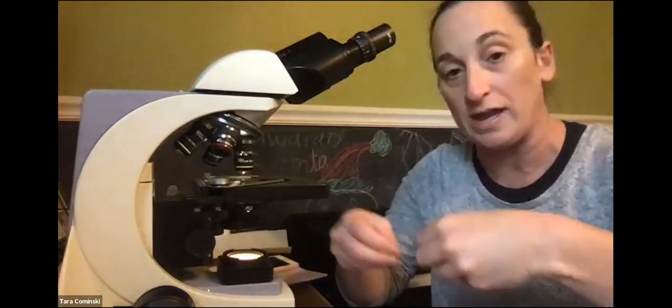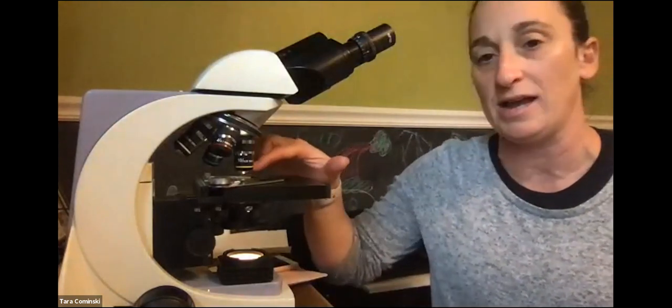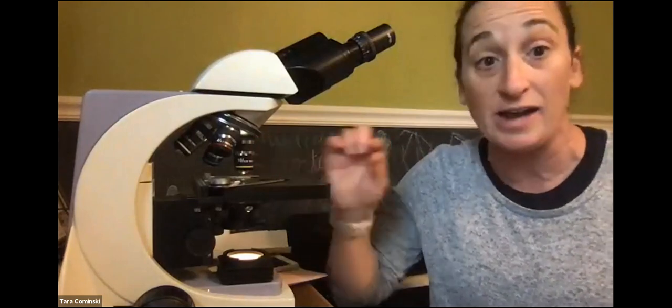And you can actually be working on it and doing surgery while looking through. The magnification is a lot lower, but you can do that. As you can see with my compound light microscope, you have to put a slide on there. It has to be really thin. There's no room to work underneath there.